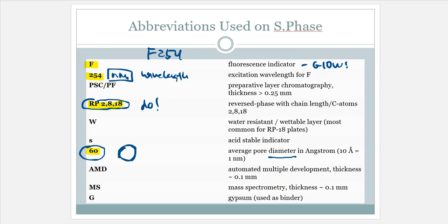I will say, though, that the MS stands for, if you've taken the spectroscopy class, just what it did in that course. It is a mass spec version of a plate. We can connect mass spectrometers to TLC instrumentation, and that will do little punch outs of plates, and it will take that compound that has traveled up the plate to that distance, and then it will clean that up and send it through a mass spectrometer.